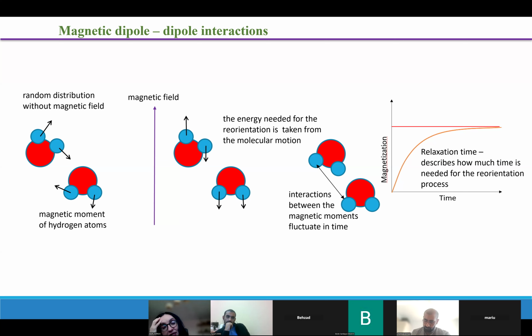And then this happens stochastically, and the question is how fast. And there's this rotational correlation time, and then the diffusion coefficient, and they always refer to something. So you can look up the diffusion coefficients, but they are related with, as I said, for instance, for translation diffusion, the probability that you make a step to the left and to the right is the same.